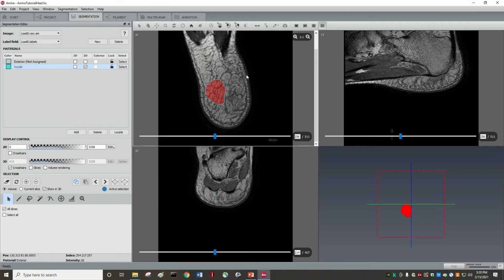So we left off at this spot. Let's remove this little segmentation that we did, so we can have a blank start. So we selected, for example, with the pick and move, and then we go to exterior and we press A, for example. Okay, we press plus and we will just add it to this. So now we have everything blank.